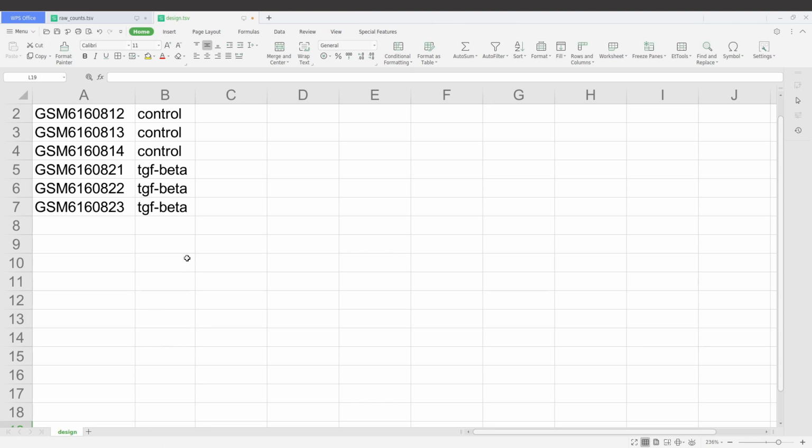And so therefore, this particular group here, this header here, which has the control and TGF-beta, becomes a factor. Now group, you can give it a different name, it's also fine, but we are just keeping that group. So we have the cells which has the overexpressed LETS1, and these are ones we do not have. So that's why I'm using the word group. So in this case, group becomes a factor.